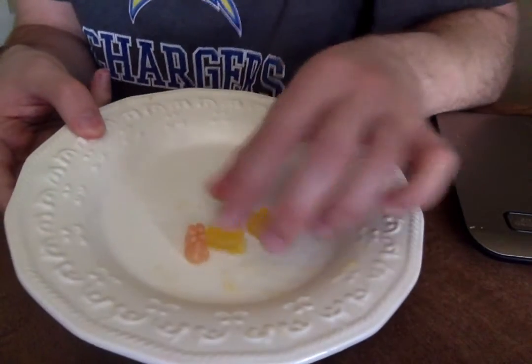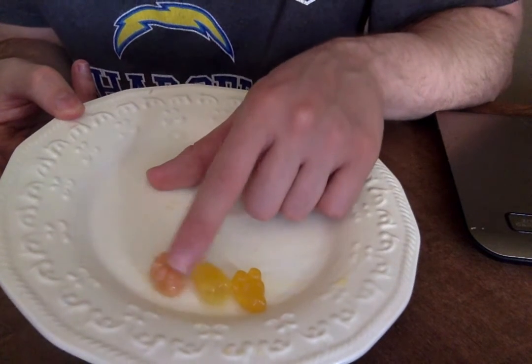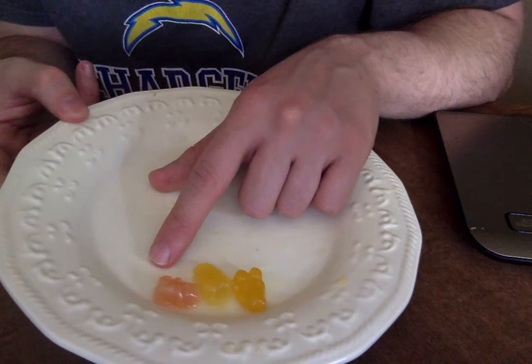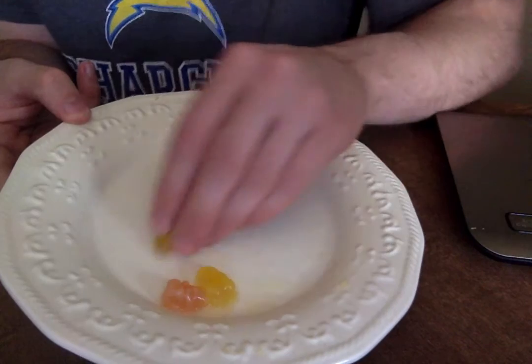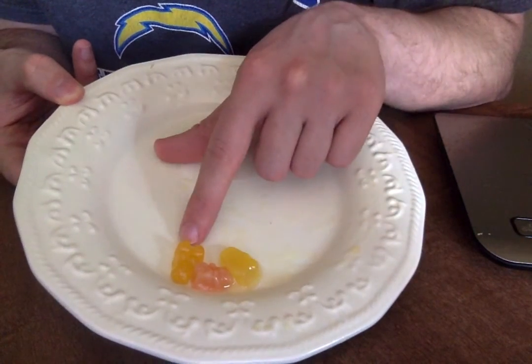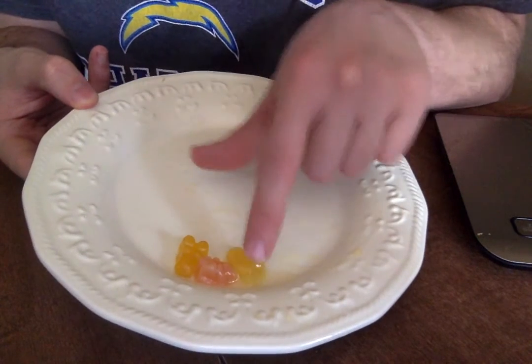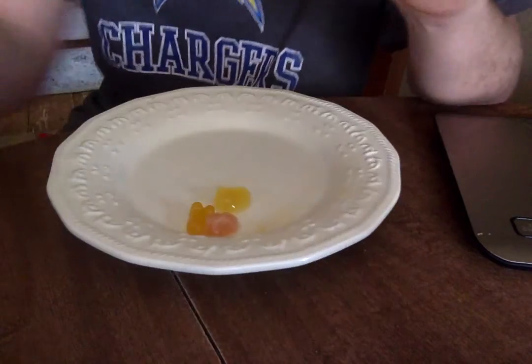But clearly, there's a visual difference, in that the one that was placed in water is much more swollen, and then the one that is placed in the salt solution looks shrunken when compared to the regular. So I'll put them side by side. This looks much more shrunken than the regular, and then this obviously looks much more swollen, and it's also much more fragile. So when I touch this one, pieces of it come off. So yeah, I'll tell you guys more about that.